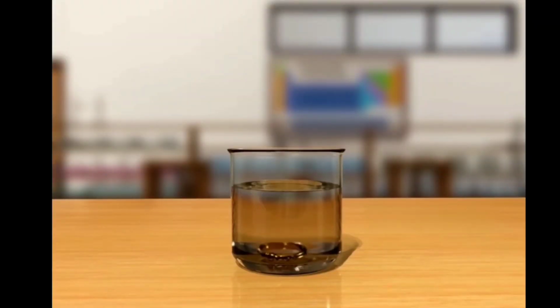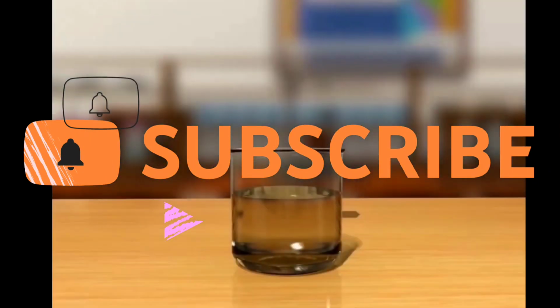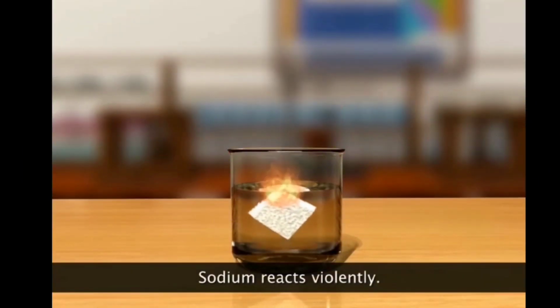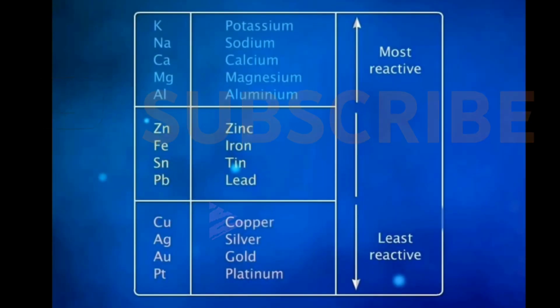Drop the gold ring into the water. Nothing occurs. Let's drop a piece of sodium metal. Metals are arranged in a table, the activity series, according to their reactivity.